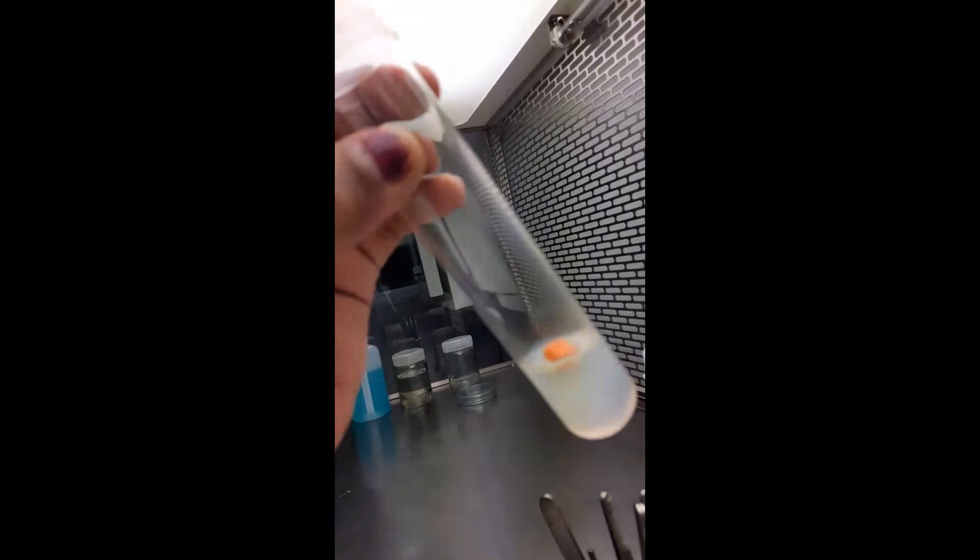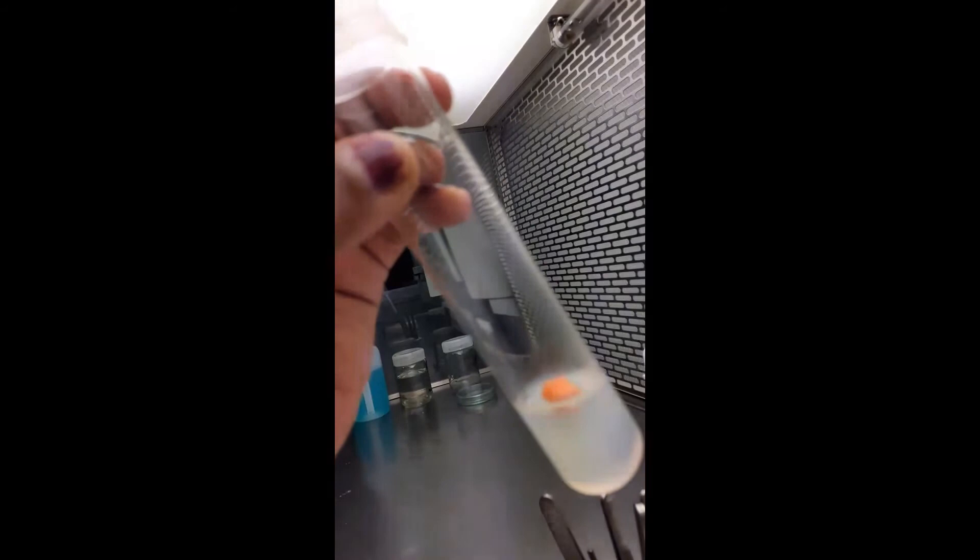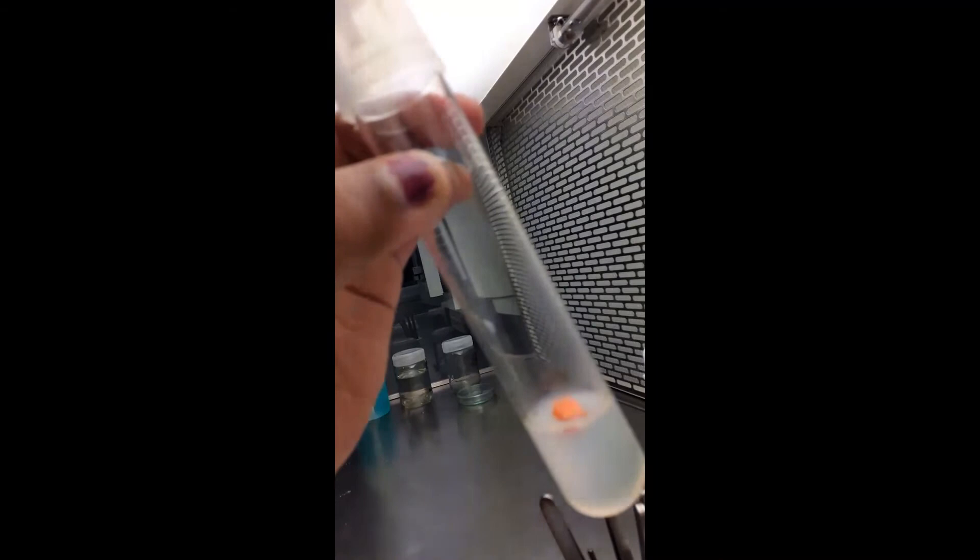Now this tube containing the carrot explant will be incubated at 25°C plus or minus 2°C. First, for 7 days it will be incubated in dark conditions, and then for 14 to 21 days it will be incubated in light conditions in an incubation or growth room. After 21 days of incubation in light conditions, you will see callus develop from this tissue.